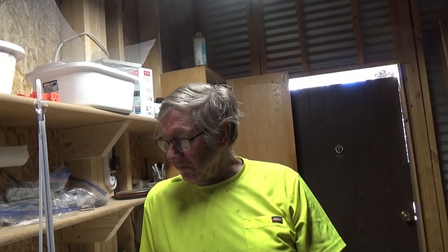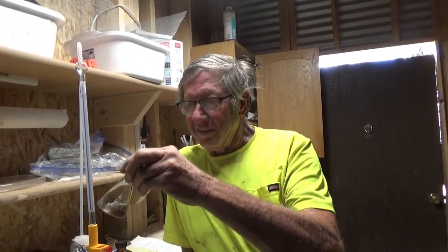So anyhow, that's basically how it's done. It's a very simple procedure. It will usually get you within a hundredth of a percent sort of thing, depending on how careful you are, how precise things are, and how well the instructions are written. But that's all there is to it. And I used to do it decades ago with cyanide, and now I'm doing basically the same thing with the Eco Goldex.